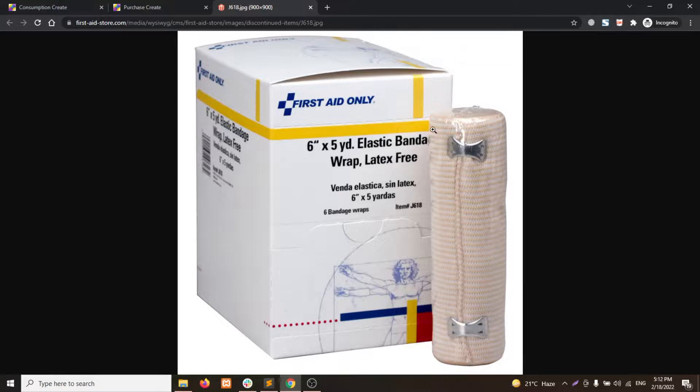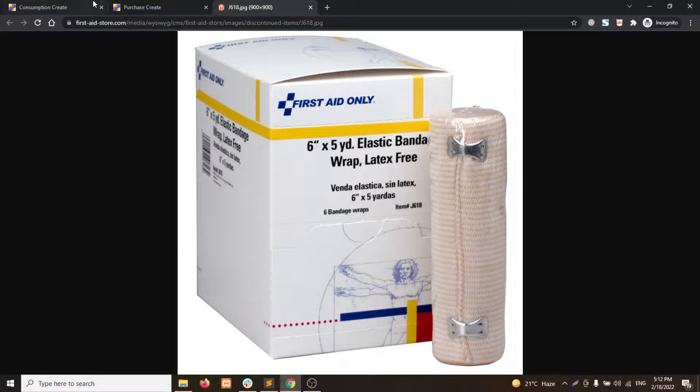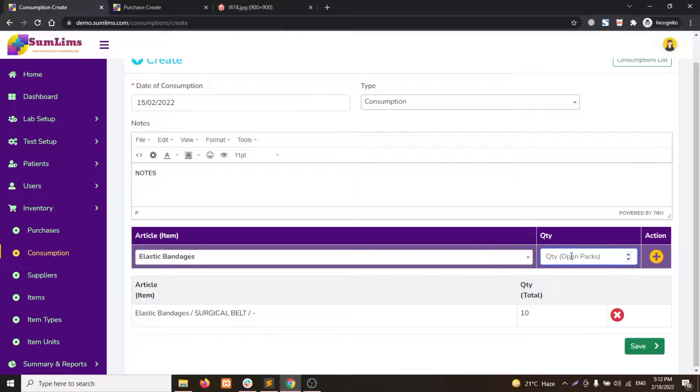We will talk about the single open quantity, and here in consumption you will write down the open quantity.